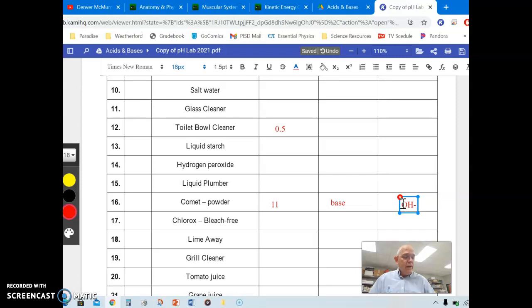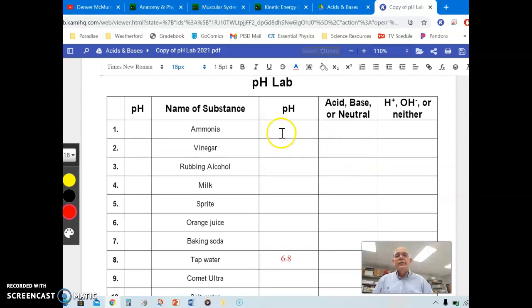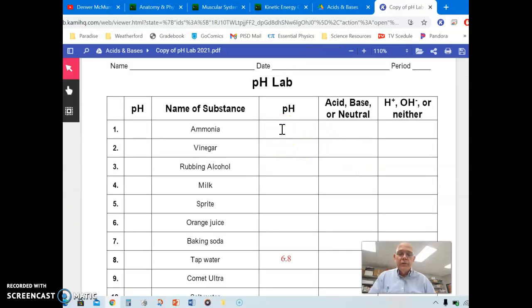Okay, so we did an example of an acid and a base. Now, all the other ones would fit somewhere on the color scale in between, okay? Like I said, a lot of these are cleaners, so they tend to be on the high side. Rather than do each one and show it to you on here, I'm just going to type in these answers, and you will need to type these in onto your worksheet as well.